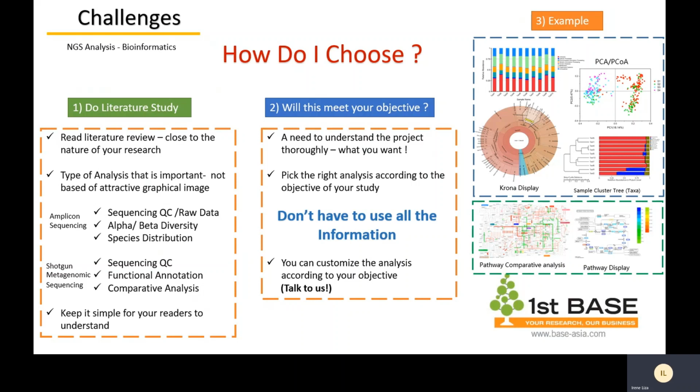Another key point when you choose bioinformatics is, will this meet your objective? So you need to understand your project thoroughly. What do you want? Pick the right analysis according to the objective of your study.